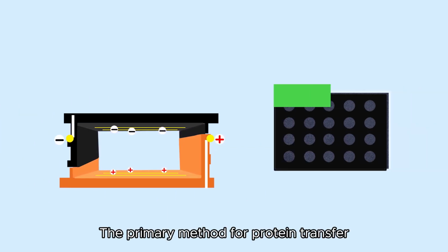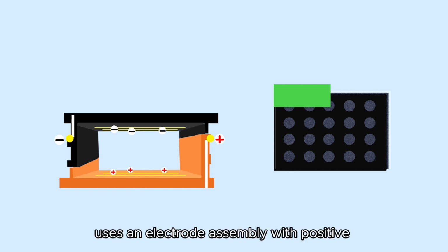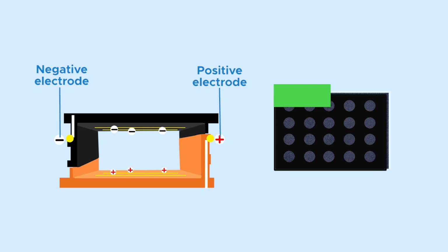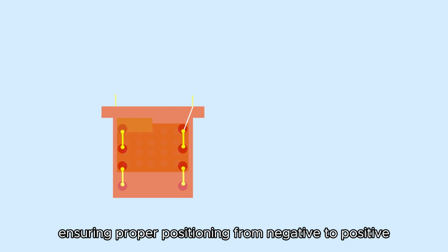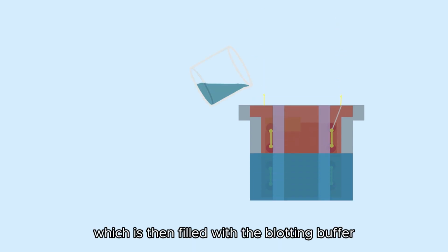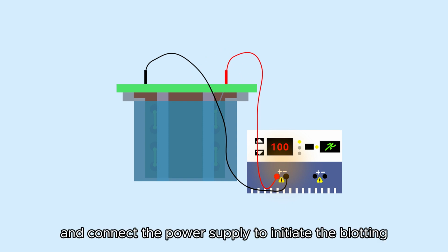The primary method for protein transfer, known as electroblotting, uses an electrode assembly with positive and negative electrodes during the process. The gel holder cassette is inserted, ensuring proper positioning from negative to positive. The inner module is placed into the electrophoresis chamber, which is then filled with the blotting buffer. Following protein separation, cover the electrophoresis tank and connect the power supply to initiate the blotting.